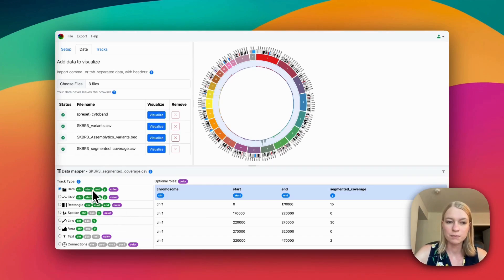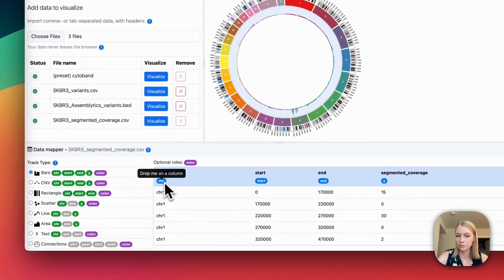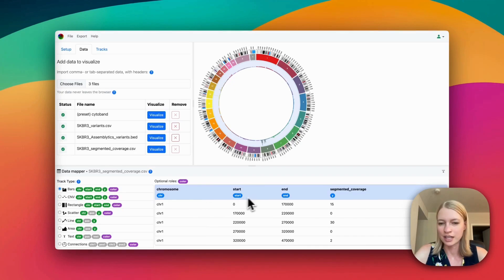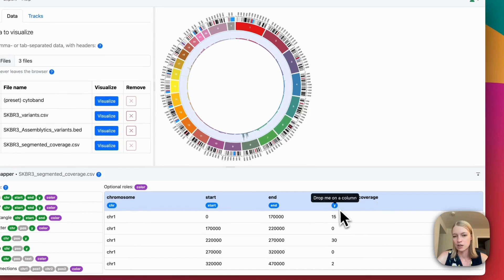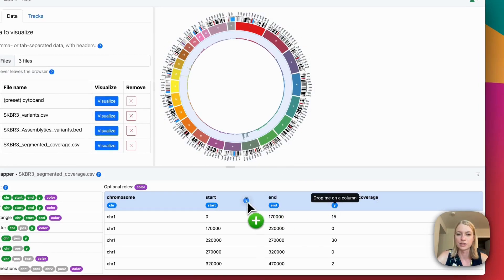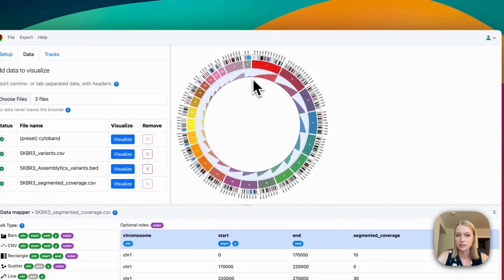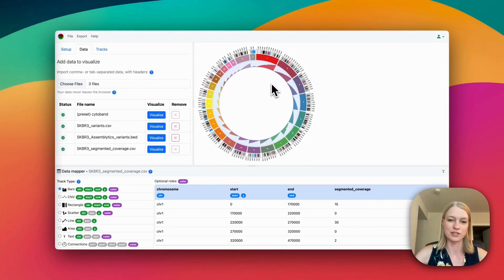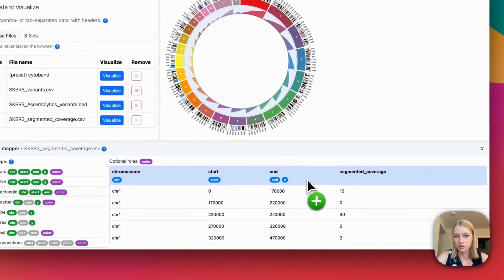For instance, for this bar chart here, it's assuming that the chromosome column is used to choose which chromosome it goes on, and you have a start and end position within that chromosome, and then the Y is segmented coverage. But you could drag the Y role onto the start, and now we're just drawing each bar as tall as the start position, or the end position, which looks very similar.